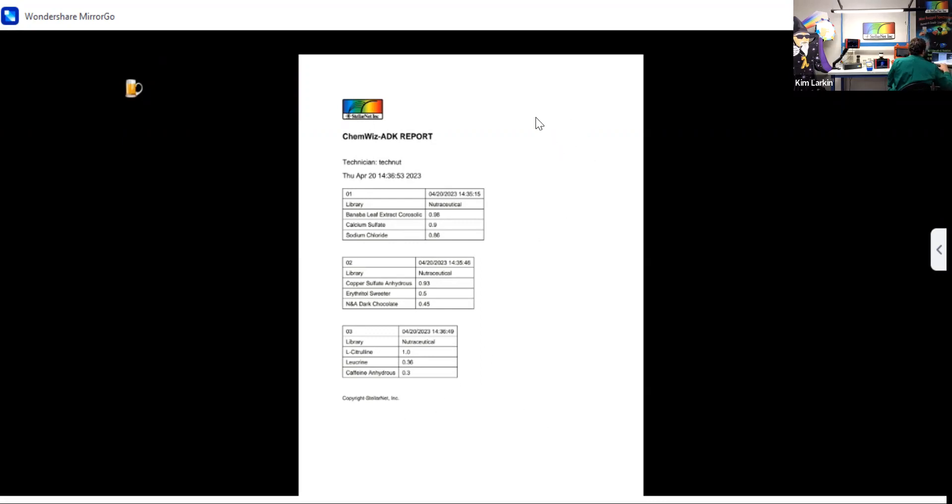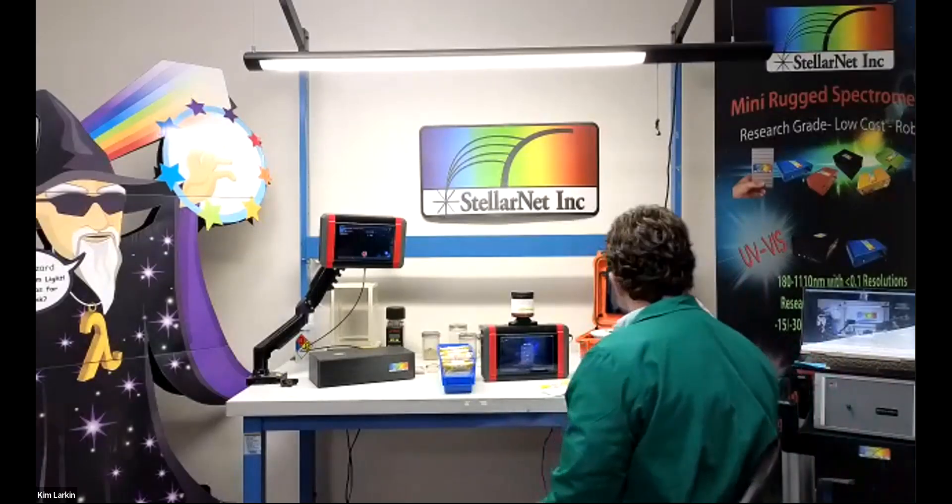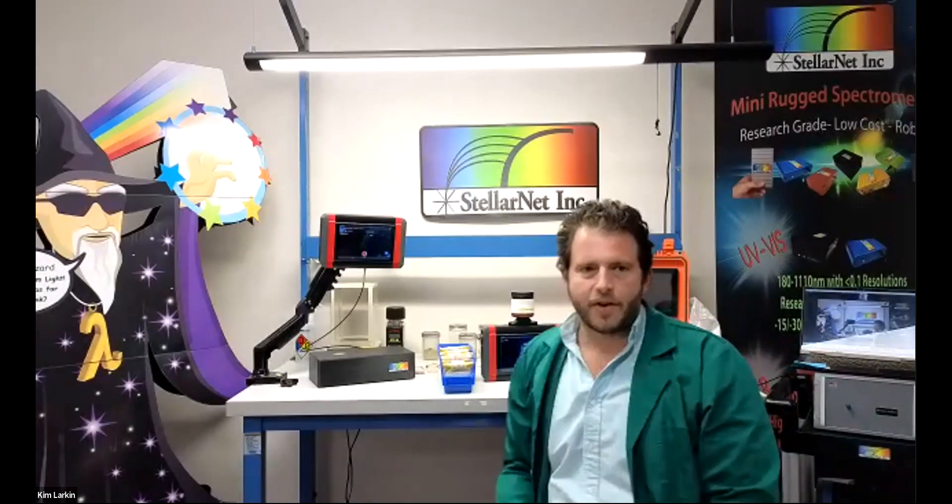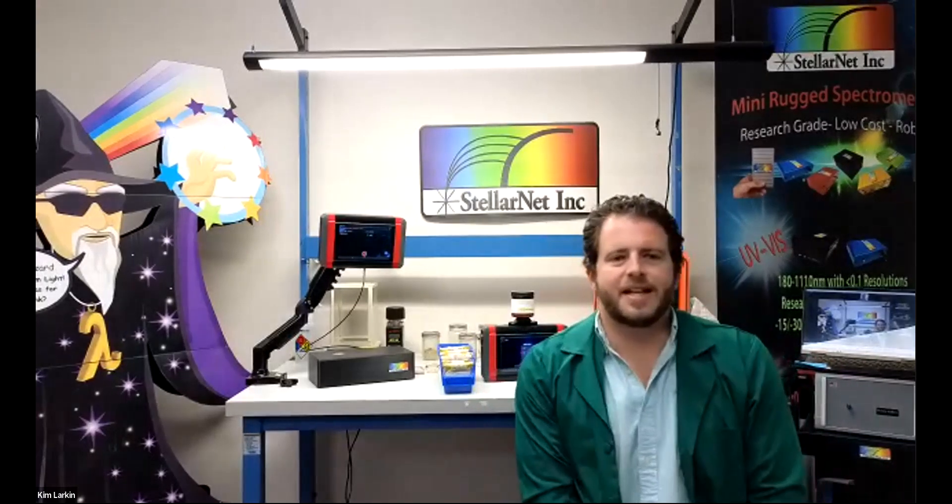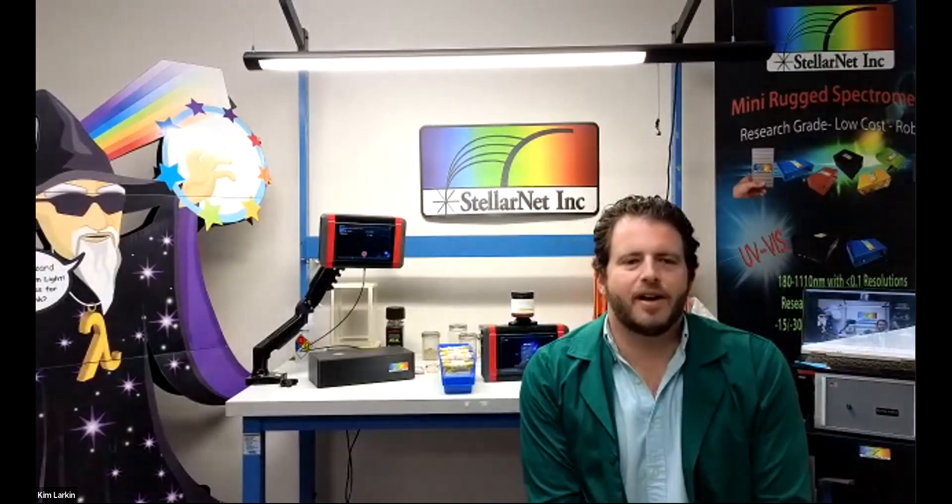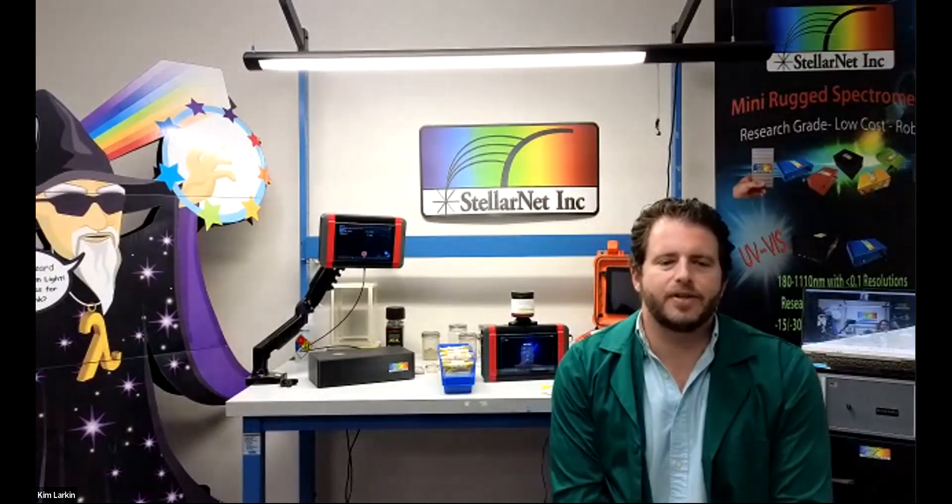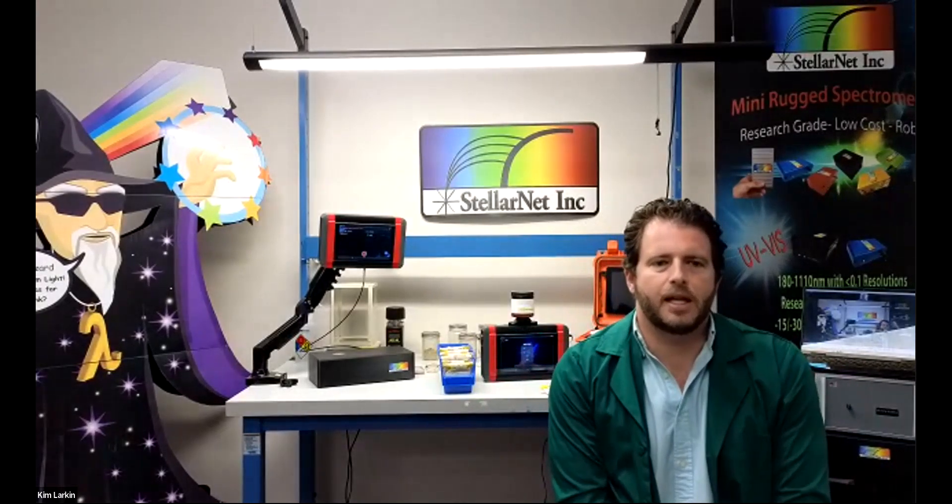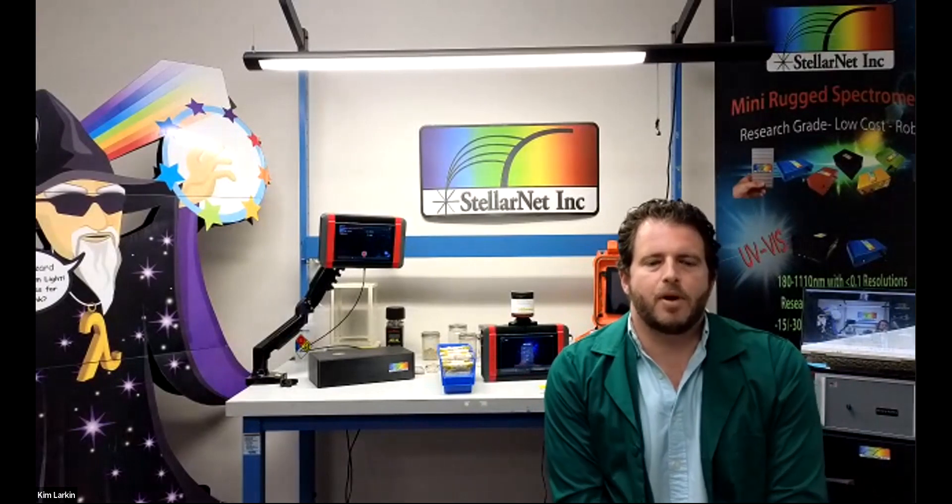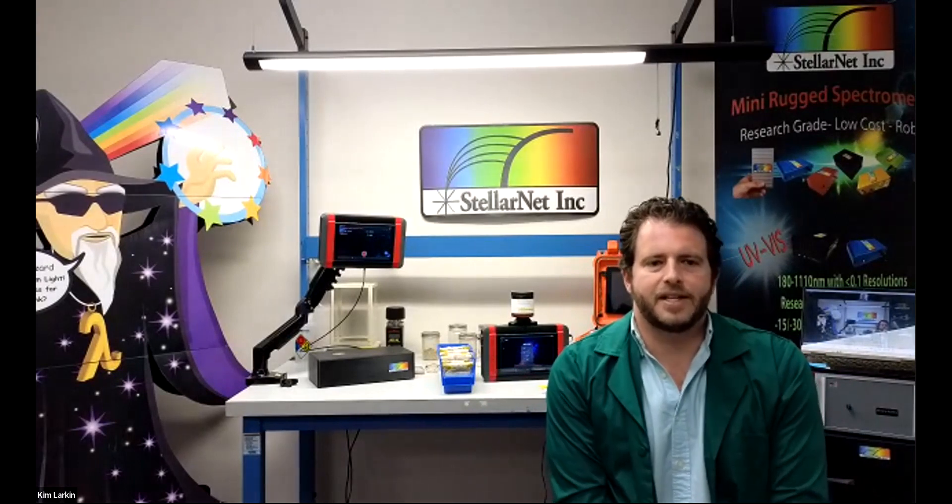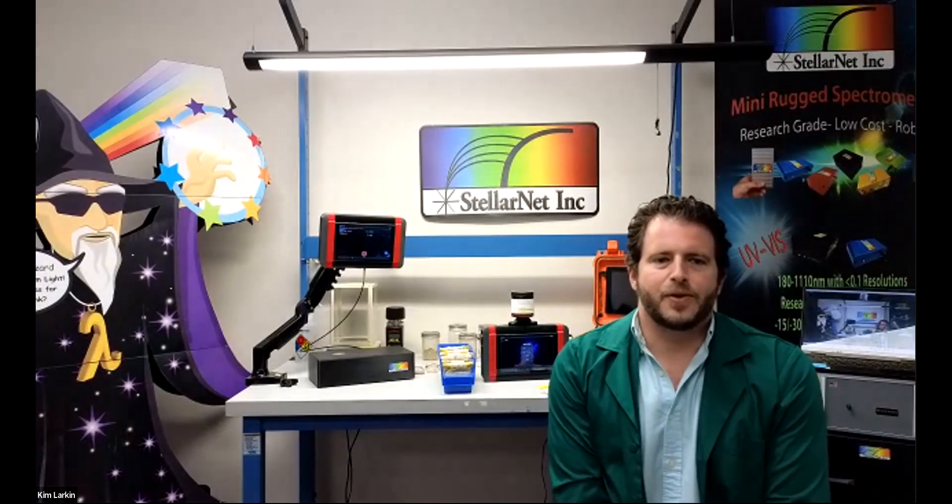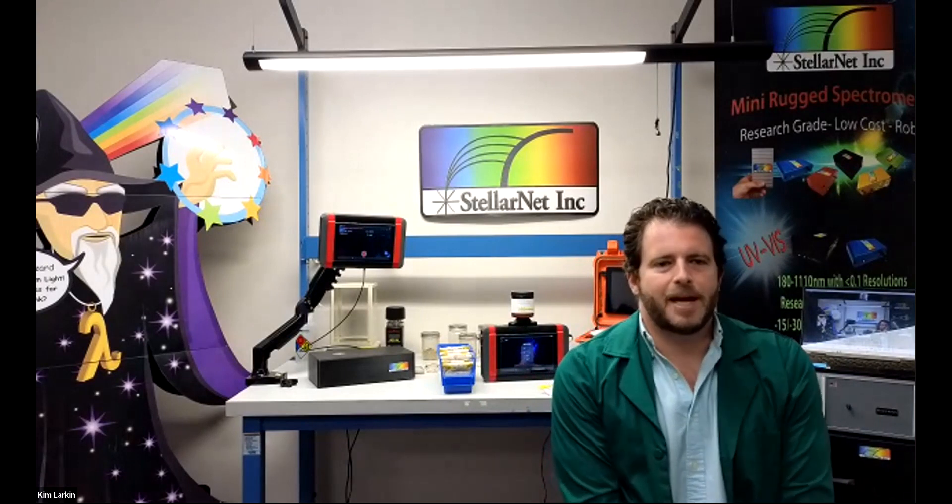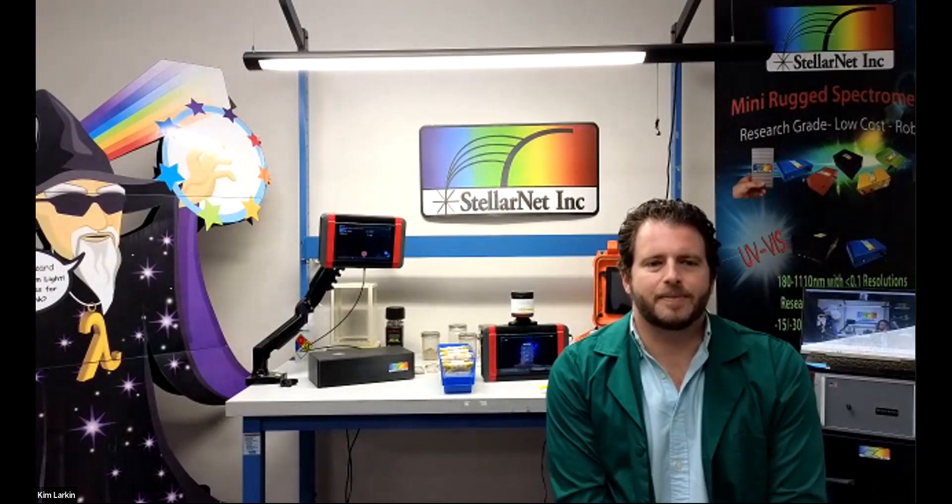This is just a standard report, but thank you very much for watching this demonstration of our ChemWiz ADK near-infrared nutraceutical analyzer. This was the demo of technician mode for doing spectral ID matching. Thank you very much for watching.